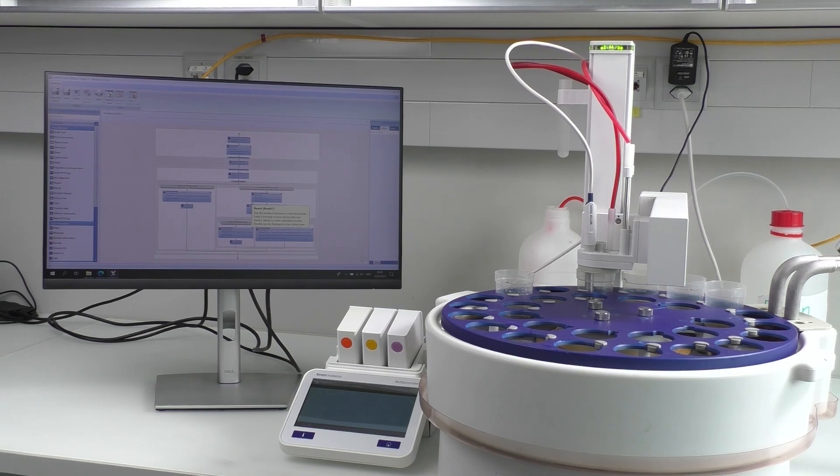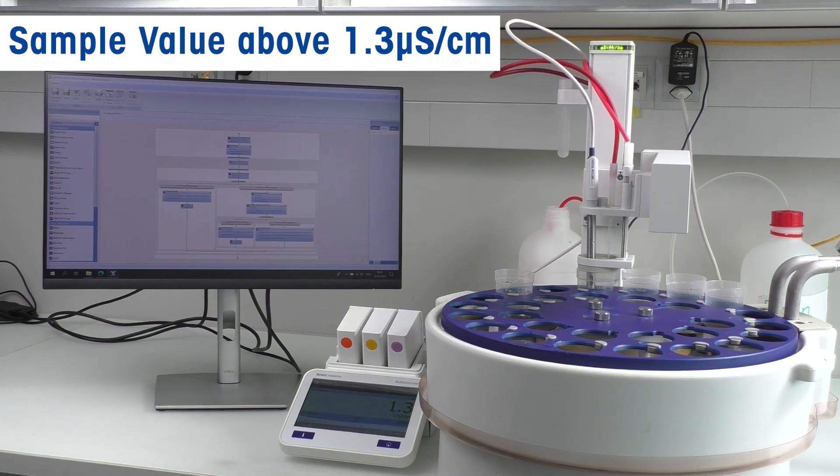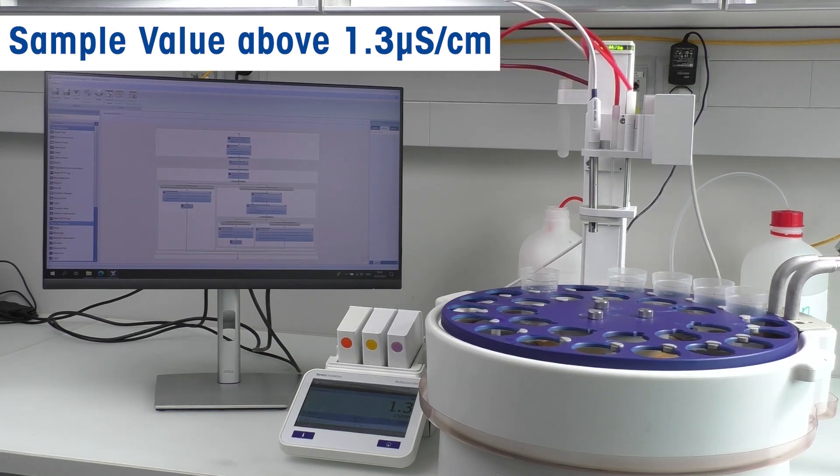In our case, four samples passed the USP645 criteria, and one sample value exceeded it. In the LAB-X software, you can easily see that the sample failed.